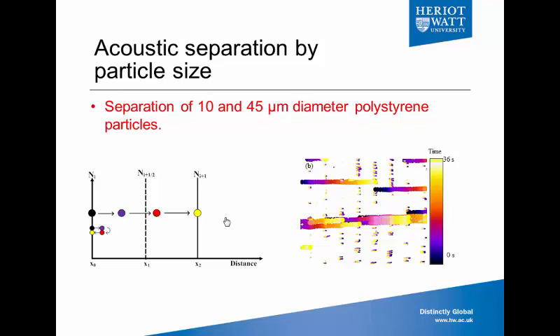So really how it works is we push the large particles, the particles that we want to extract from the heterogeneous medium, just enough to pass the antinode, and that is the ramping time.